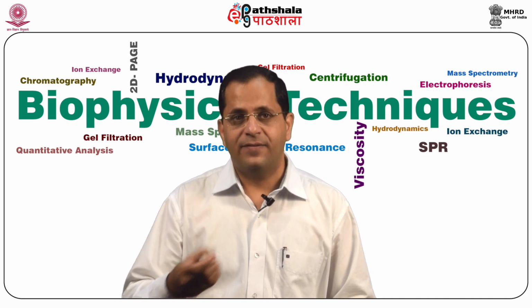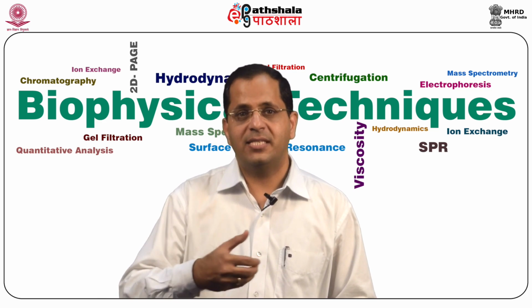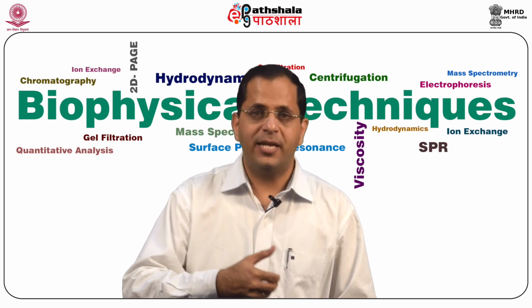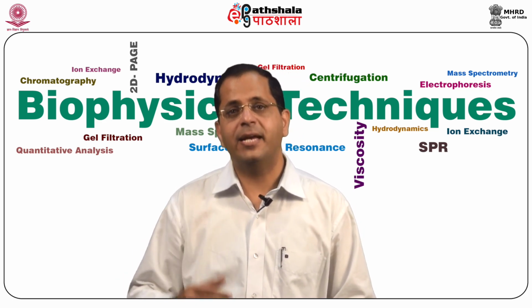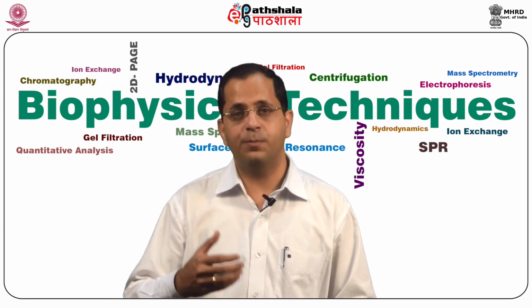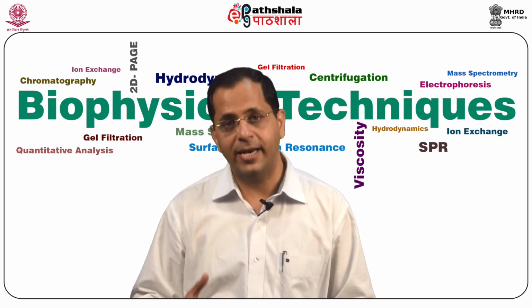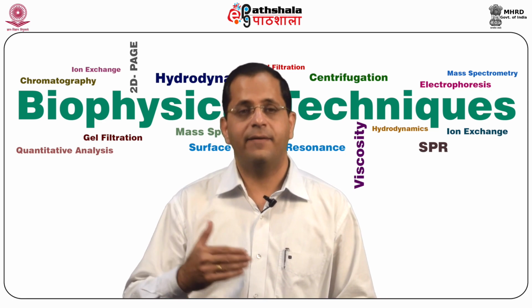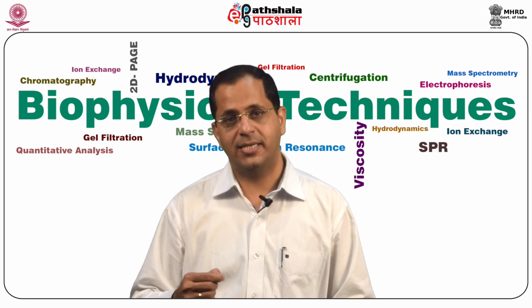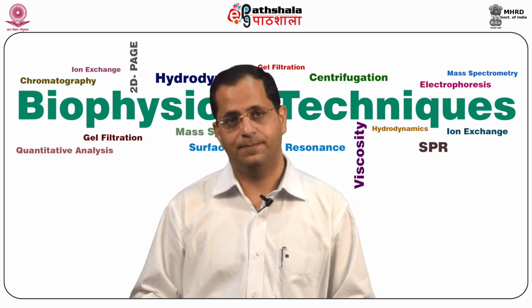This is the dye where there is a standard for every spot on the gel and all gels within the same experiment are quantitatively linked. The gel to gel variations are eliminated, making technical replicates optional. The internal standard is used to match and normalize the protein patterns across different gels, thereby negating the problem of inter-gel variation. Accurate quantification and accurate spot statistics between the gels can also be obtained for these experiments.